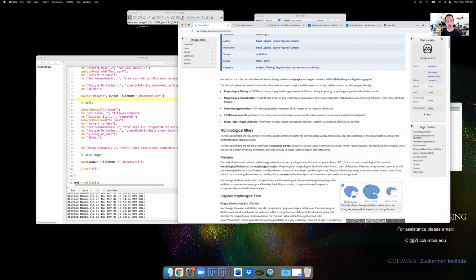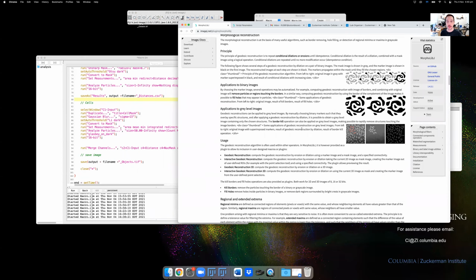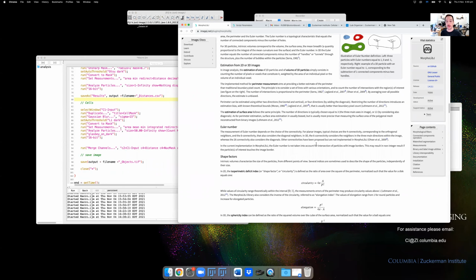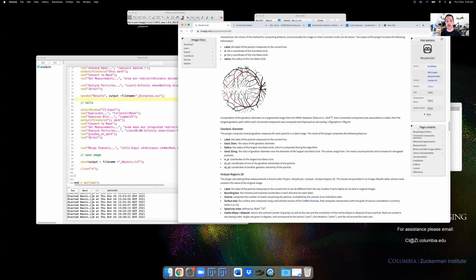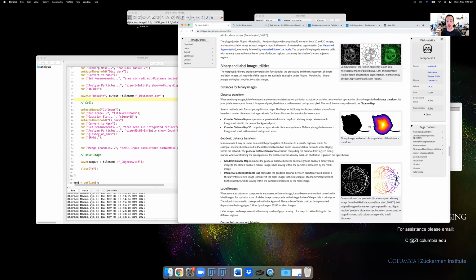It's fantastic for doing both 2D and 3D segmentation. And he's put in here some really nice distance transformations. There are some really useful ones, and they're all described here. There's some for looking along, like what we're doing for this project, looking from the nucleus or from the cell membrane, but also following along projections, which is really cool for neuron processing.